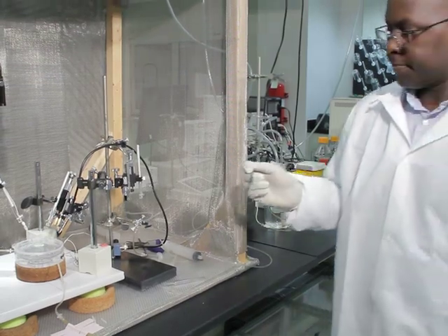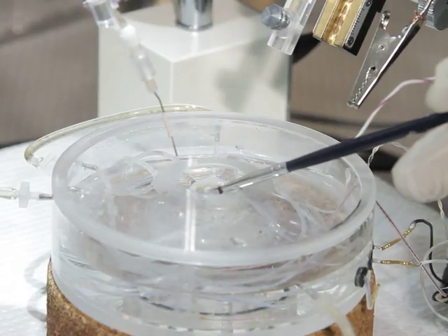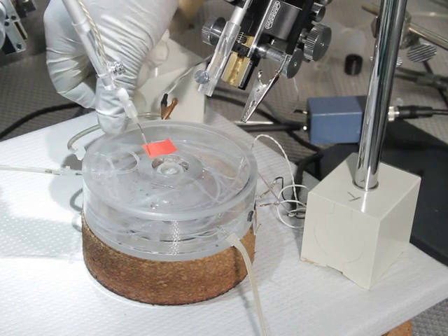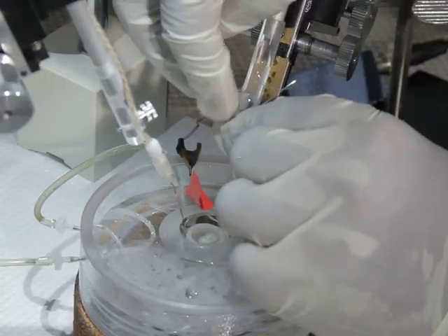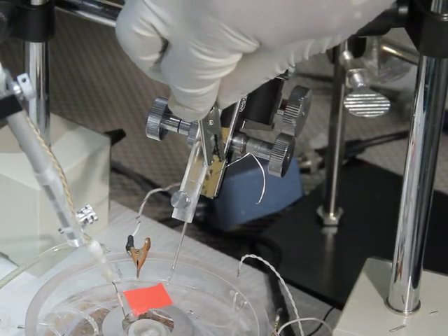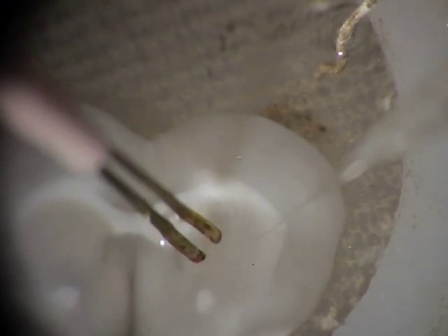Transfer a slice to the slice holder in the recording chamber, which is continuously perfused with oxygenated ACSF at room temperature. Submerge the silver/silver chloride reference electrode in the slice holder and connect it to the head stage with an alligator clip. Attach the carbon fiber microelectrode to the micromanipulator and connect it to the head stage with an alligator clip. Next, lower the tungsten stimulating electrode and the carbon fiber microelectrode to the surface of the striatal brain slice.